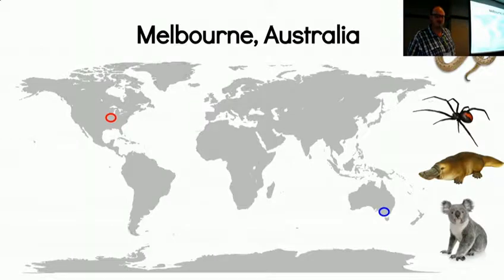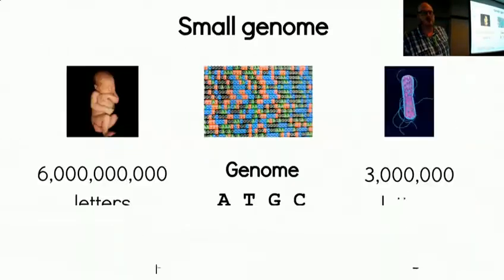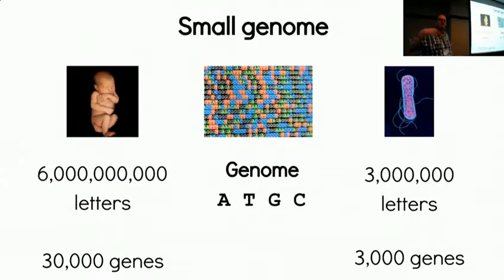All right, so just a quick recap. This is about small genome annotation, and in fact, it's specifically going to be about bacterial genome annotation. We can do viruses and other things, but we're focusing on bacteria. Just a reminder, bacterial genomes are quite small compared to, say, a human genome, but they still have quite a lot of genes.